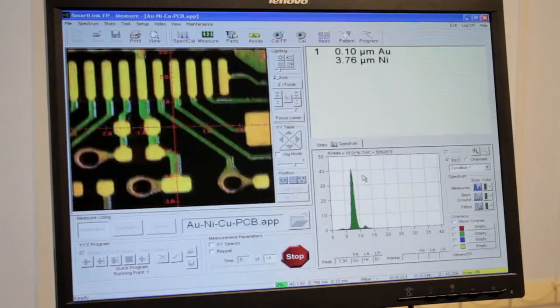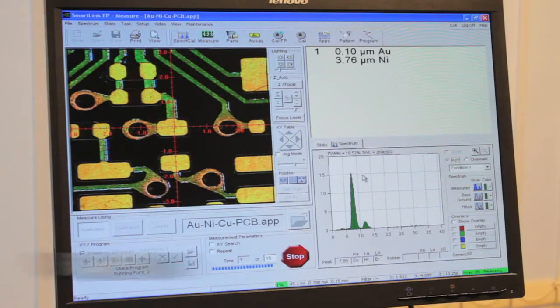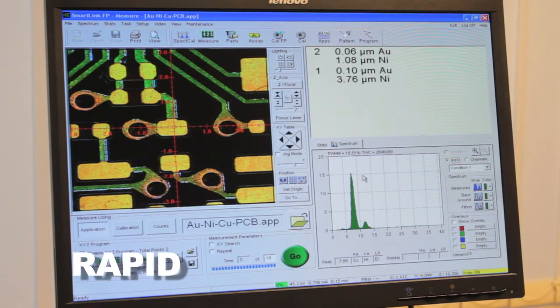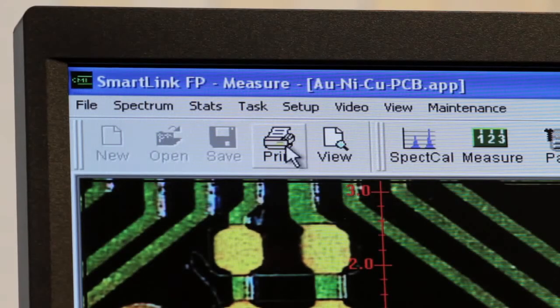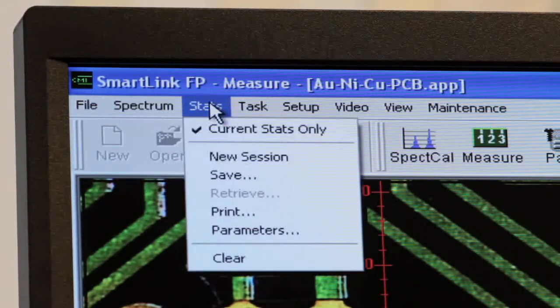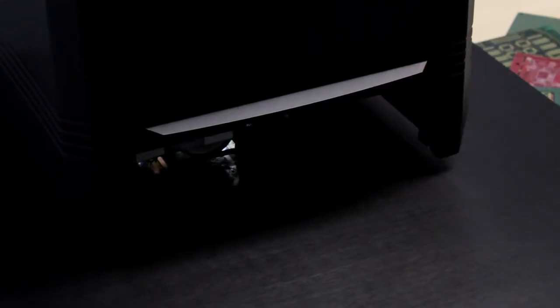When the analyses are complete, the analysis results appear on the screen, often in seconds. You can then save the results for future reference or print them as required. The door is lifted and the sample removed.